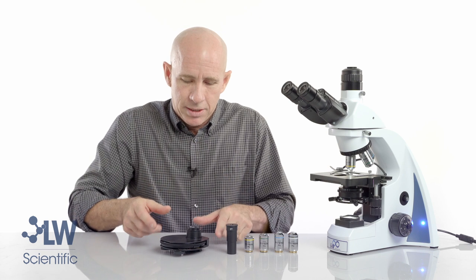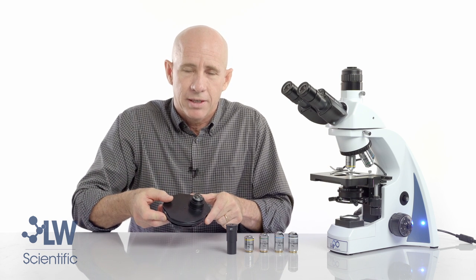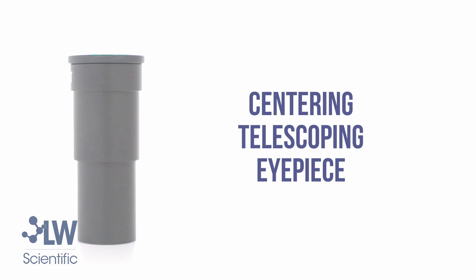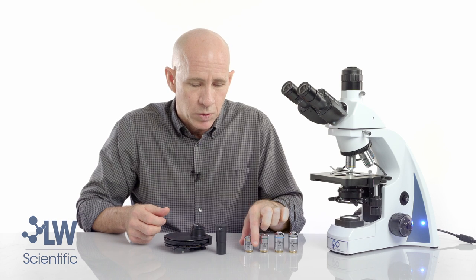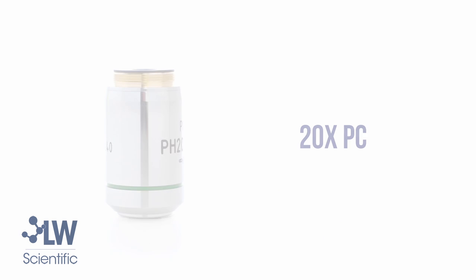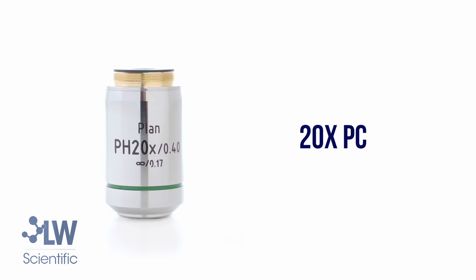In the phase contrast kit you will receive a phase turret condenser, a centering eyepiece, and four objectives which are the 10x infinity plan phase, plus a 20x phase, 40x phase, and a 100x oil.